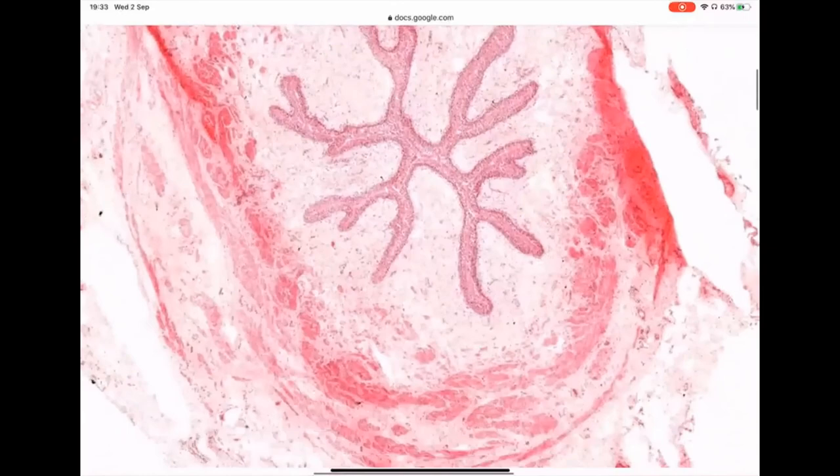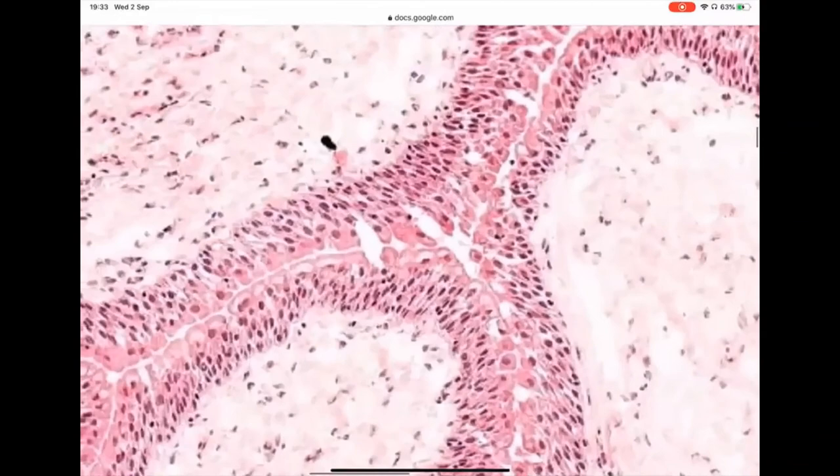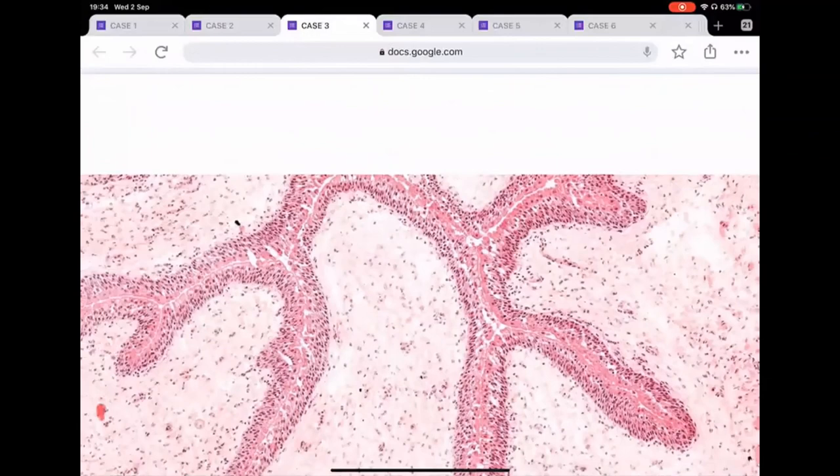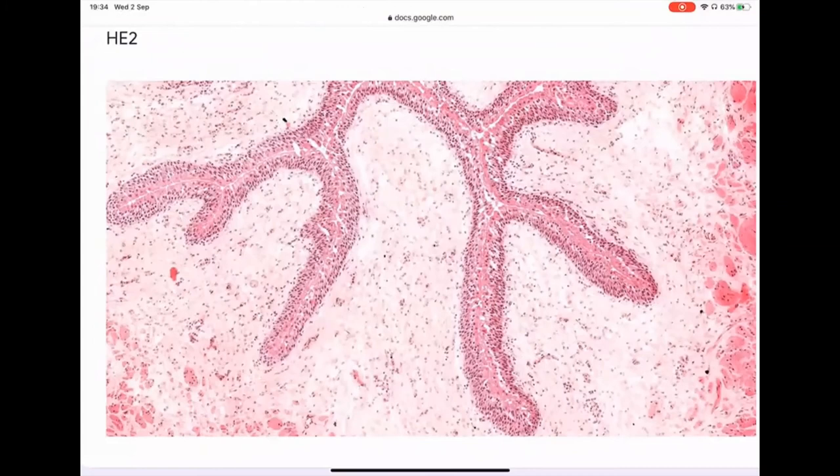So this is number one. Number two is, when you look into the ureteric specimen here, it is important as well to look at the lumen. It's important to decide if this was dilated or not. Okay, because if this was a dilated segment of the ureter, then that means that there might be a stricture lower down, okay? And if there is a stricture that has been instrumented, you might then start to get a reactive type of urothelium, which you might overcall. So this is also another thing to focus on.